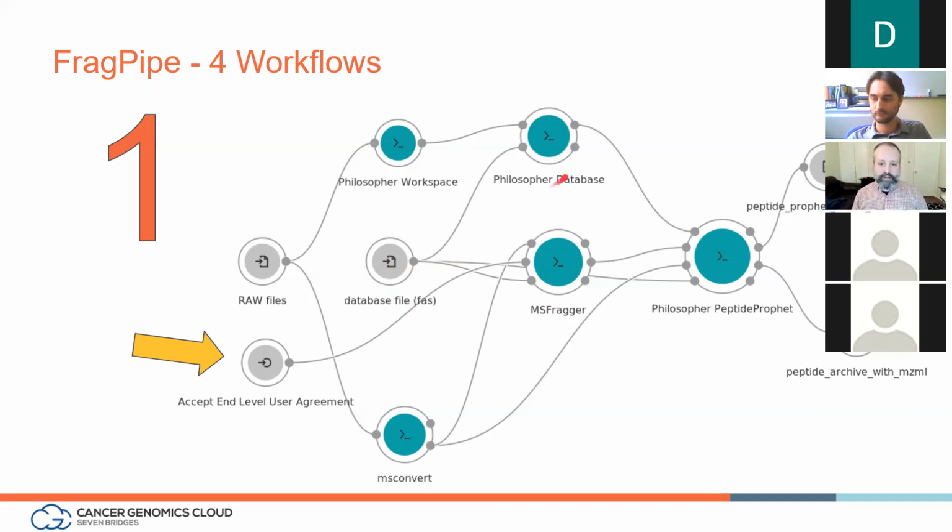Honestly, there's a tremendous number of parameters, more than any other workflow I've seen. Felipe added hundreds of parameters that have been documented, and you can change them. So that's the first step.